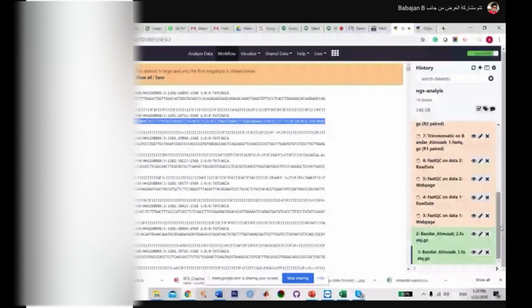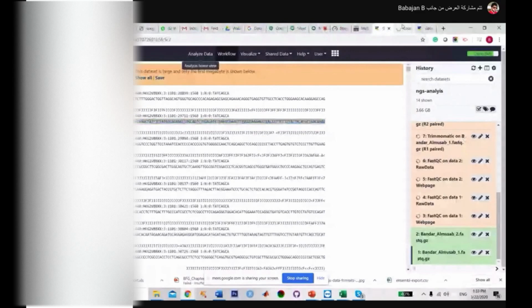Once it is processed, I will show you how the next file looks. It is going to take some time, I think 5 to 6 minutes, as I told you.